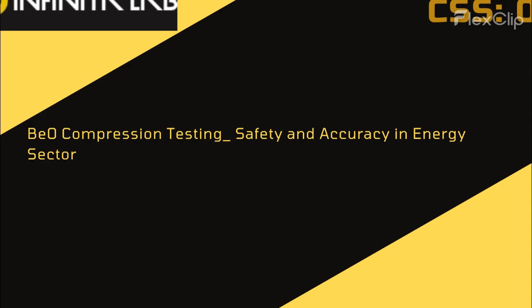So they took the time to really understand what they were dealing with. Absolutely, because safety's on the line. Makes sense. And then they went a step further. They actually designed a custom testing setup. They engineered a special containment chamber for the compression testing, to contain the material itself.